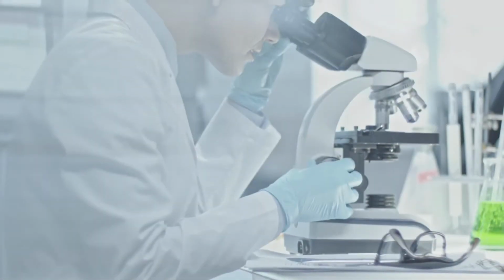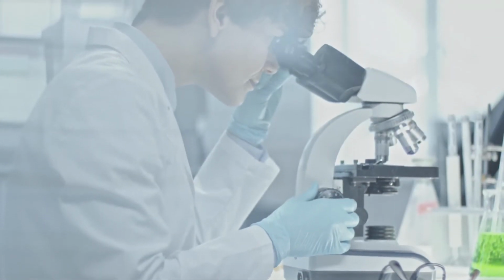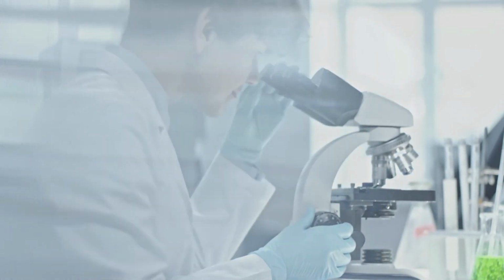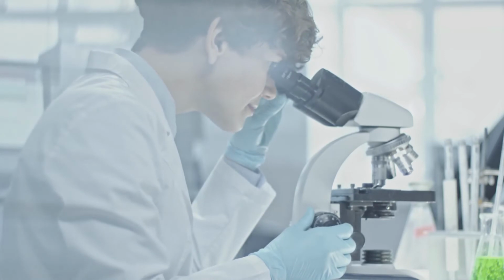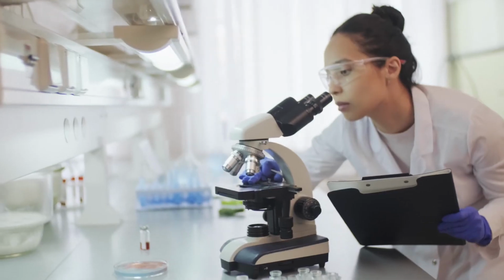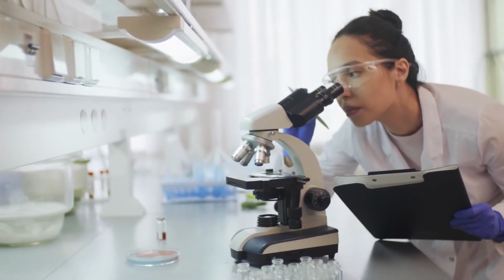Mr. Walton here. Today is our first day of the biology unit, and we want to talk about microscopes. Now, microscopes ushered in a new way of observing life, and they changed our understanding of where life comes from and how living things operate. We're going to talk a little bit about the history of microscopes, as well as what modern microscopes look like and how to operate one.